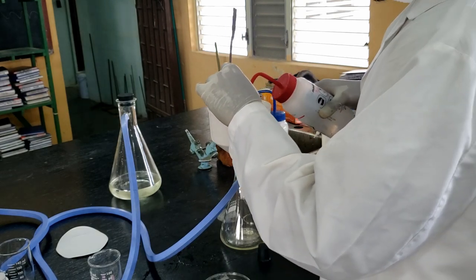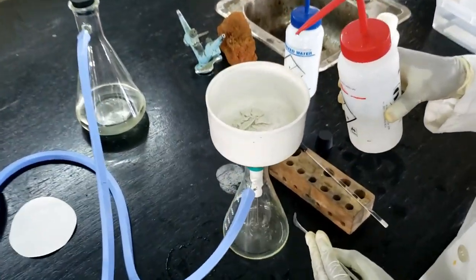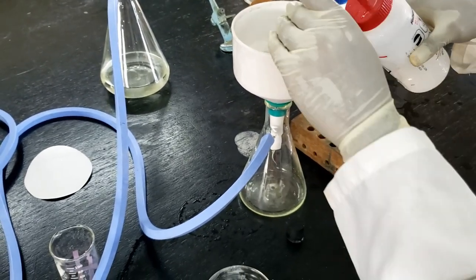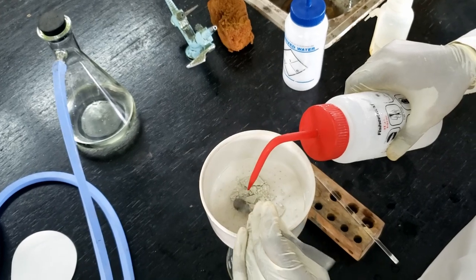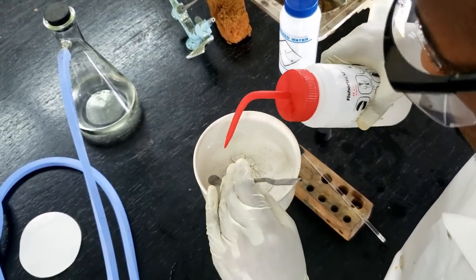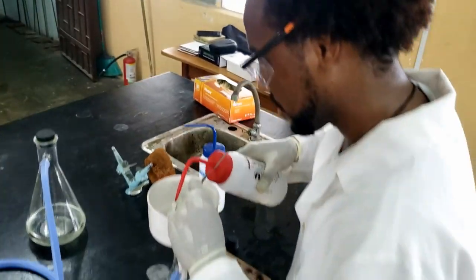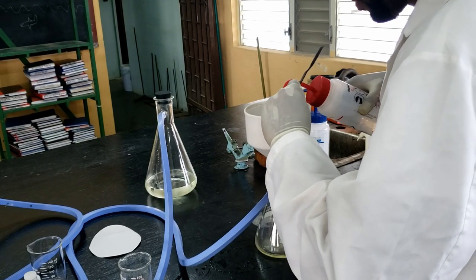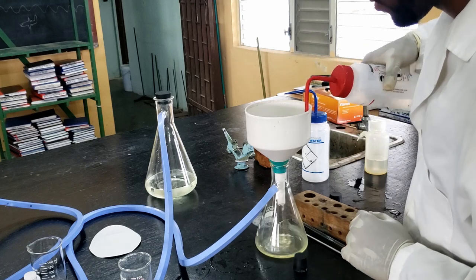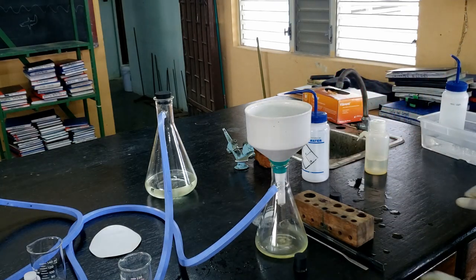The yellow crystal that we just had is going to start losing its color, so it's going to go more of an off-white color. And the solution we collect here as a filtrate this time is our mother liquor, so we want to save that mother liquor for the following steps that will come. Let that dry on the vacuum a bit.